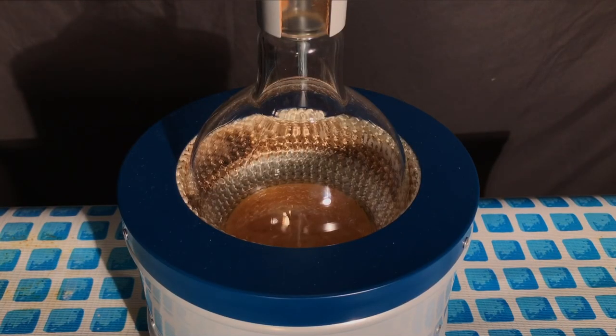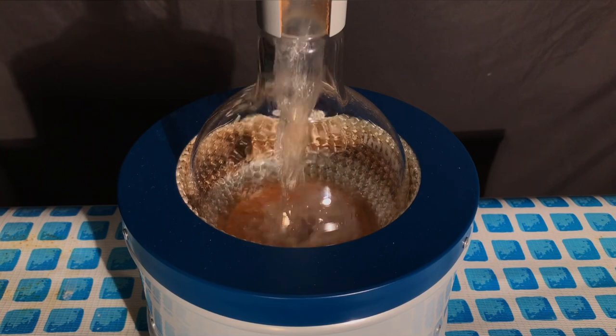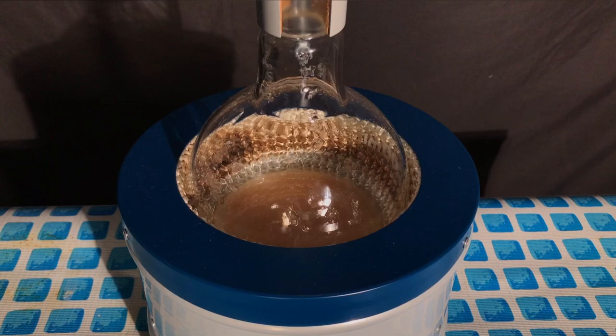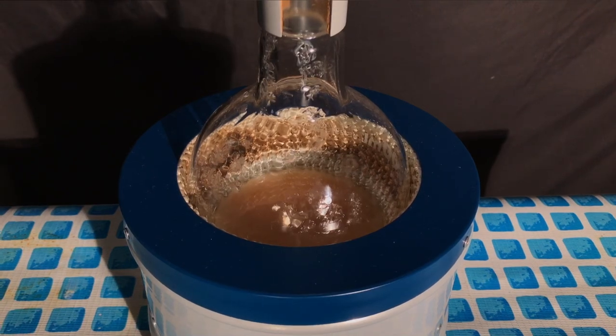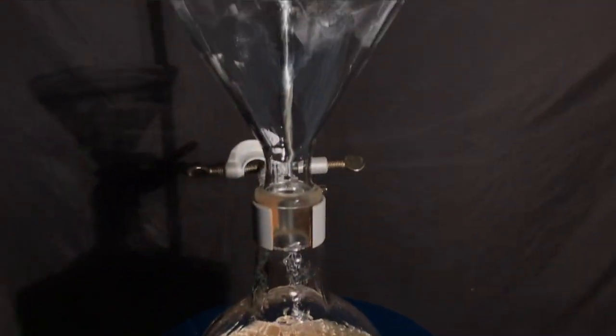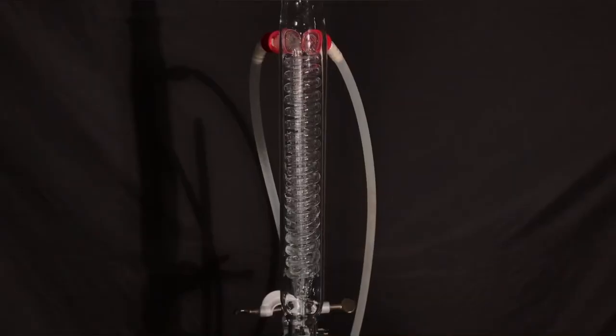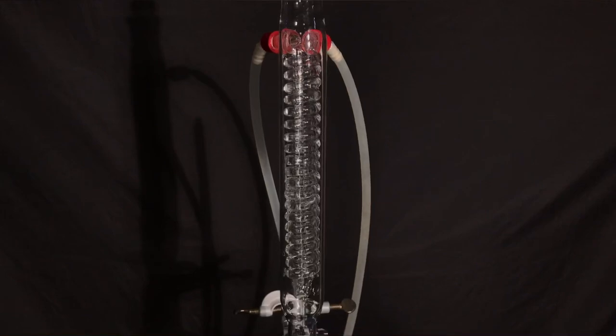After cleaning up everything, the glacial acetic acid was added to the rest of the solution. It doesn't participate in the reaction, but it's just used as a solvent. In my experience, it increases the yield significantly. After everything had been added, a reflux was set up. The condenser was flushed with water, and we were then ready to begin.